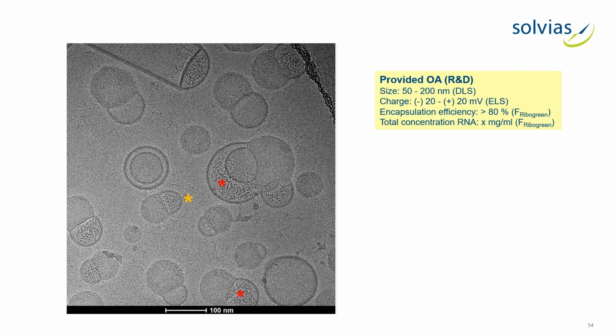I would like to start with this really nice picture, a cryoEM image of an LNP system. But what can we see here? We can see spherical-like forms. We can see blebs and twins and LNPs, all in different shades of gray and varying significantly in their size. This formation seems to stand out from the surrounding by the lipid layer, and this is typical for liposomes and LNPs.